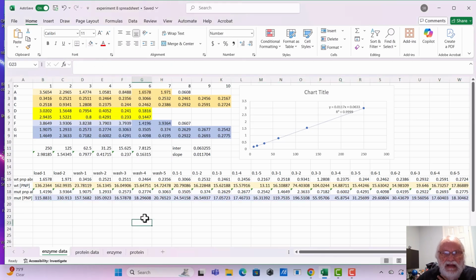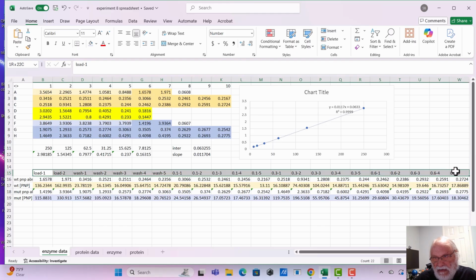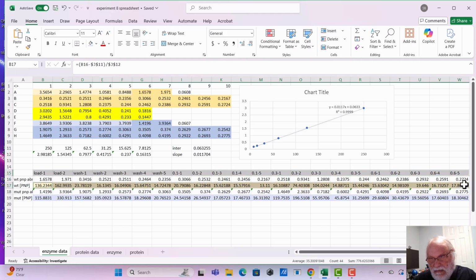At this point, I'm always kind of interested to see how things look. And what I'm going to do is draw a preliminary graph. And actually, you'll see how I will just modify that graph as we go. So here it goes. We'll highlight this entire area, all the X's, and then I will hold the control down and do all of the Y's. Okay?